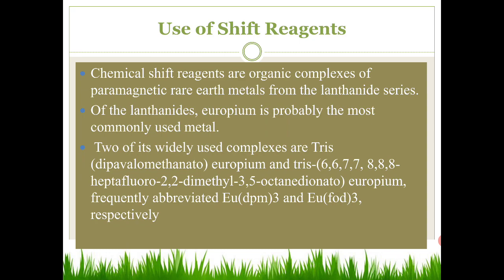Two of its widely used complexes are tris(dipivaloylmethanato)europium and tris(6,6,7,7,8,8,8-heptafluoro-2,2-dimethyl-3,5-octanedionato)europium. Frequently, these two metal complexes are abbreviated Eu(DPM)3 and Eu(FOD)3 respectively, with the 3 as a subscript.